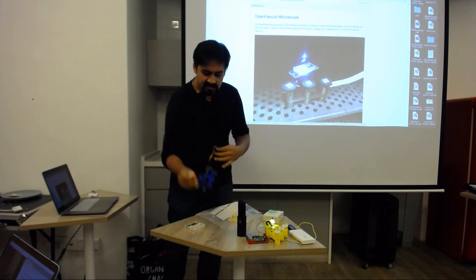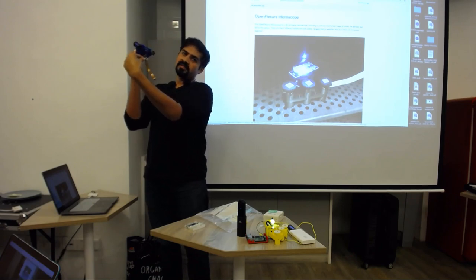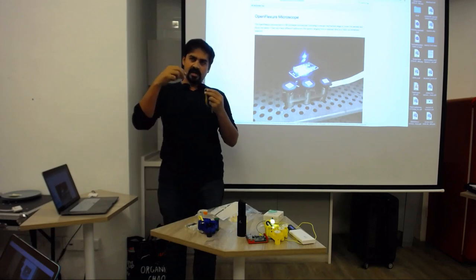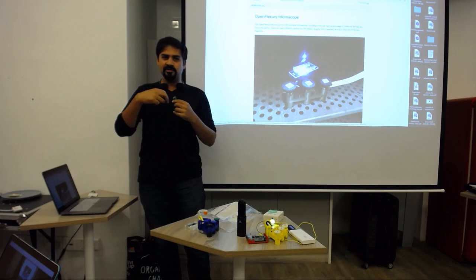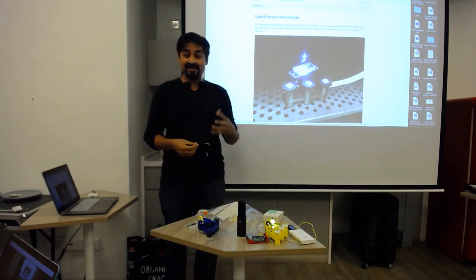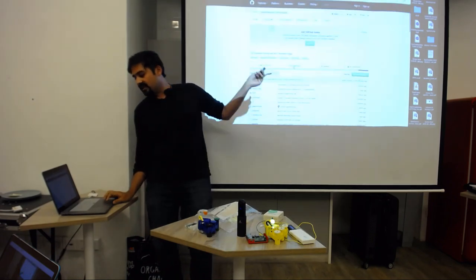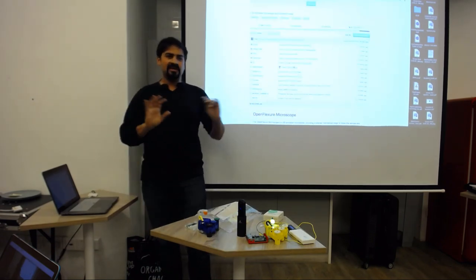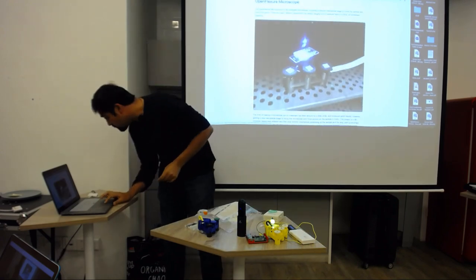So inside this is where your camera goes. It gets slotted in there. And so it's a little bit difficult to disconnect and take out the lens. So of course, there is a 3D printed tool that you can use to do that. It's part of the design. It's in there. Okay, so this is the GitHub repository. Look for Open Flexure Microscope, and there are like a bunch of variations you can play around with. I highly recommend you do it.